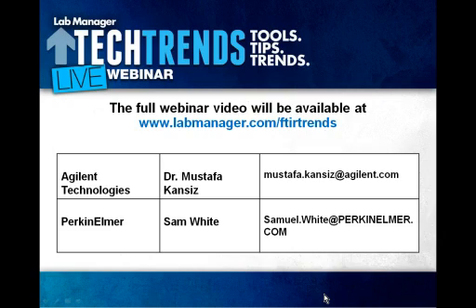If I may start, the size range, there really is no limit. It can just depend on whether you have an automated stage. Automated stages will give you up to 3 by 5 inches, at least in our system, of travel. The question is really what sort of spatial resolution, what sort of magnification is required, and that can range anywhere from 1 micron at the ATR level up to, in our case, 19 microns per pixel. And the time required.